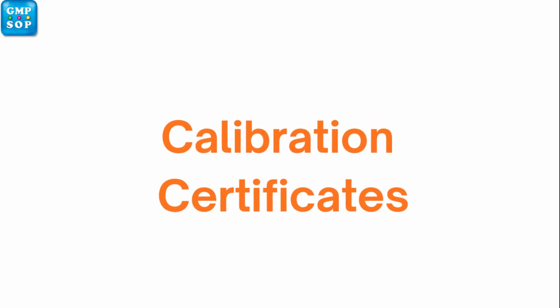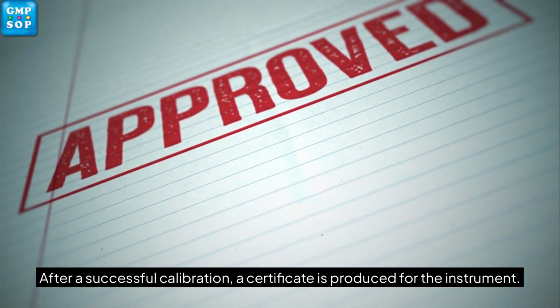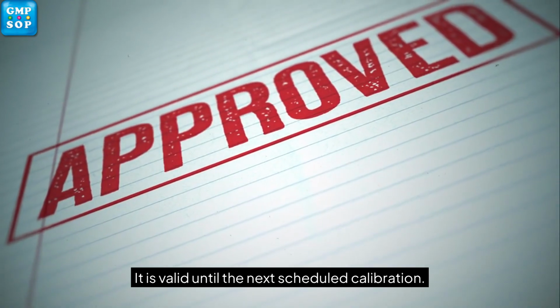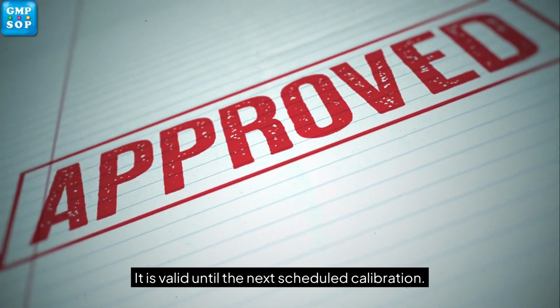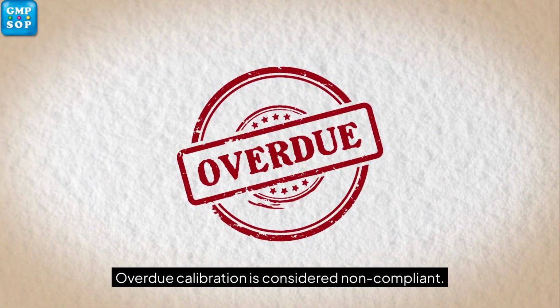Calibration certificates. After a successful calibration, a certificate is produced for the instrument. It is valid until the next scheduled calibration. Overdue calibration is considered non-compliant.